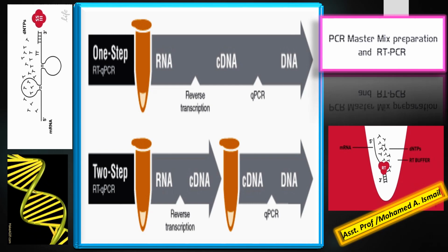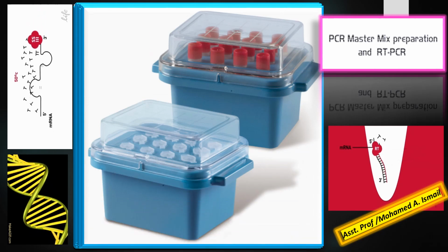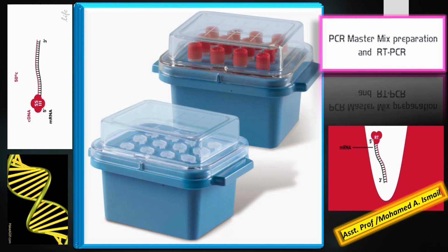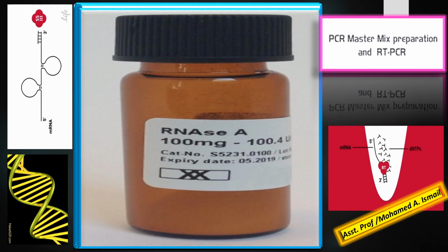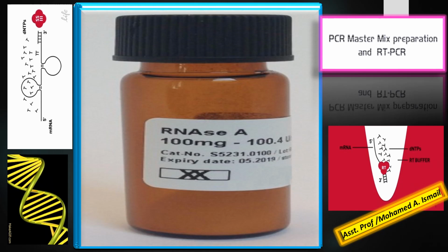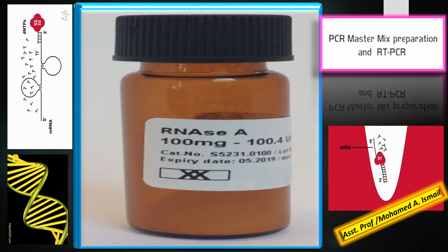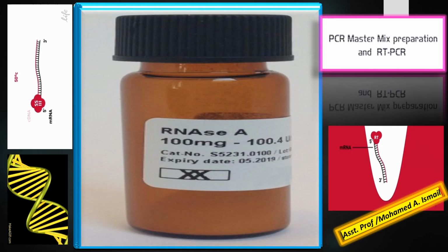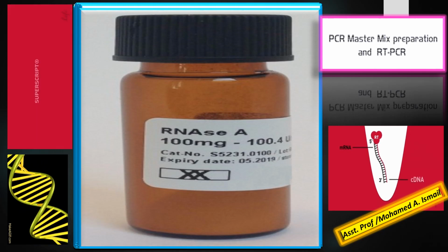Note that the reagents should be kept on ice for the duration of the master mix preparation. Prepare and label enough PCR tubes for the number of samples to be tested, and then separate the necessary amount into each single PCR tube.